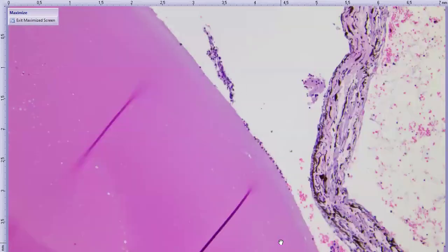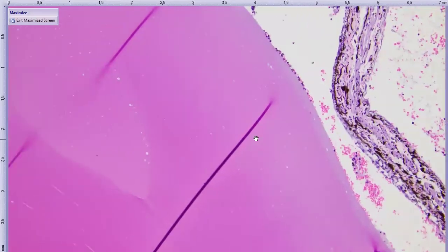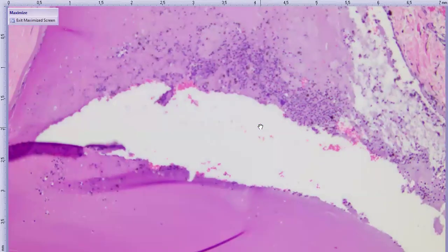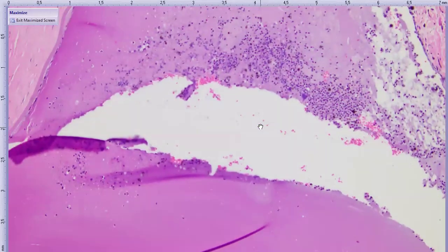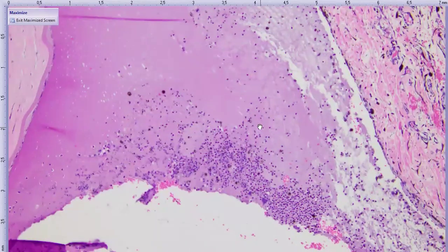Looking at our lens here. So as I mentioned, our lens capsule is no longer associated with these lens fibers. These areas where we have these large pools of liquefied lens protein, and infiltrating that are scattered neutrophils. Inflammatory cells theoretically should not be able to extend through an intact lens capsule. So the fact that we do have a pretty substantial phakitis is supportive of a lens capsule rupture.